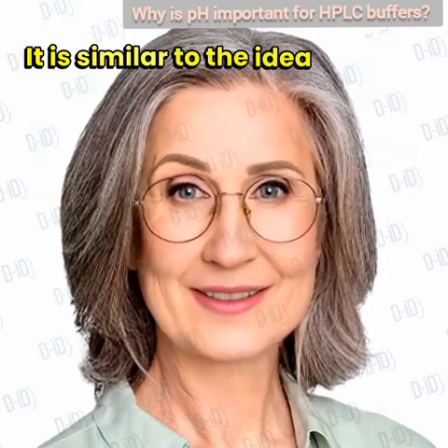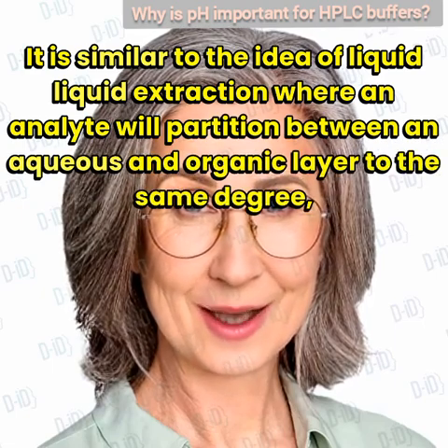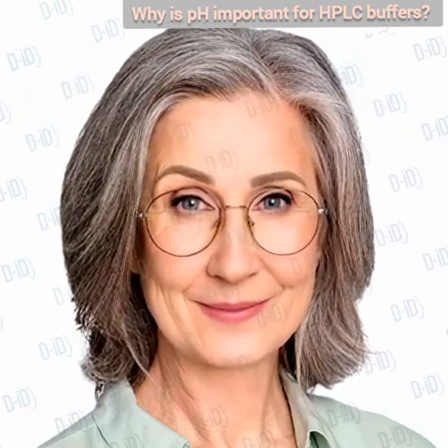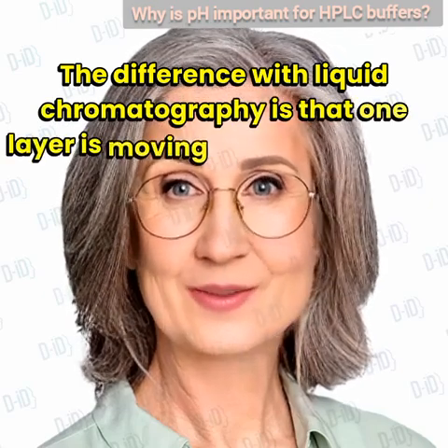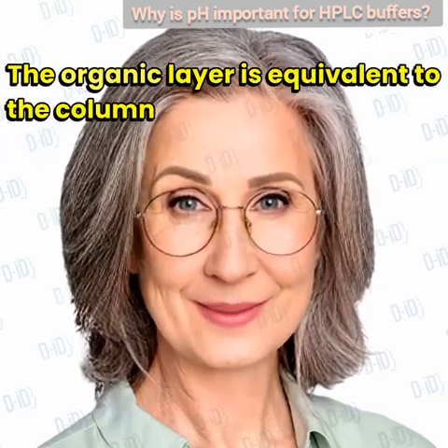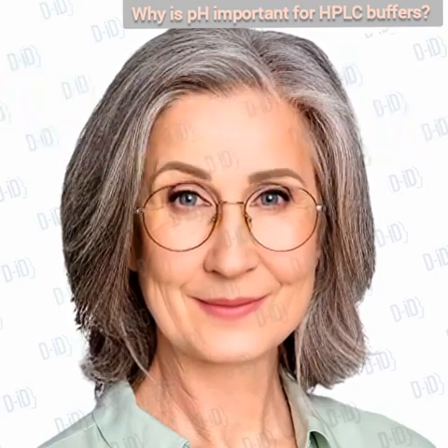It is similar to the idea of liquid-liquid extraction, where an analyte will partition between an aqueous and organic layer to the same degree, provided all other variables, such as temperature, agitation time, and pH, are constant. The difference with liquid chromatography is that one layer is moving. For reverse phase, RP, HPLC, the organic layer is equivalent to the column stationary phase, C18 for example, and the more polar mobile phase is part of a dynamic system.